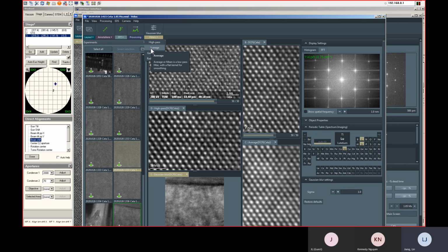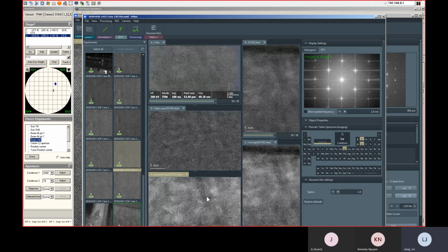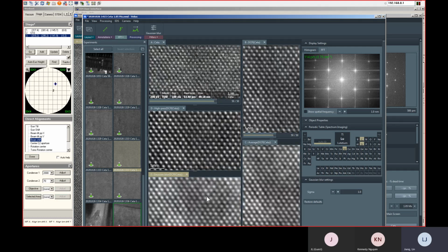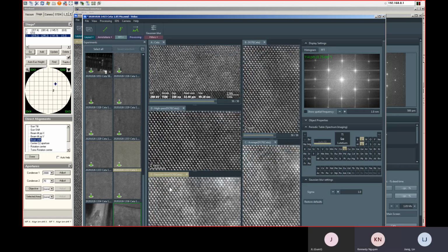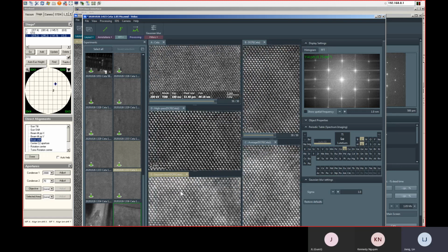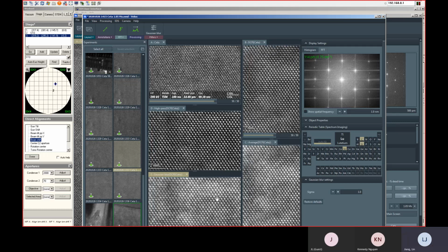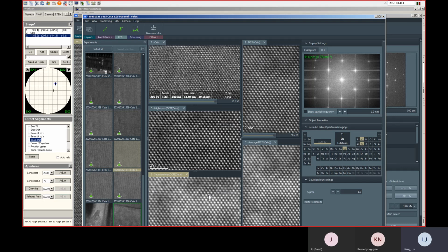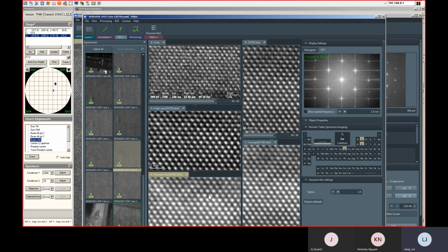If you're doing the filtering in a 3x3 region, it's going to first count the signal intensity in this 3x3 region, and then redistribute the intensity into this 3x3 region evenly. This is average filtering. But Gaussian blur is very similar, but they use a different redistribution method.